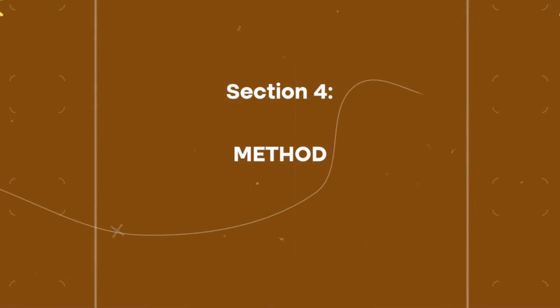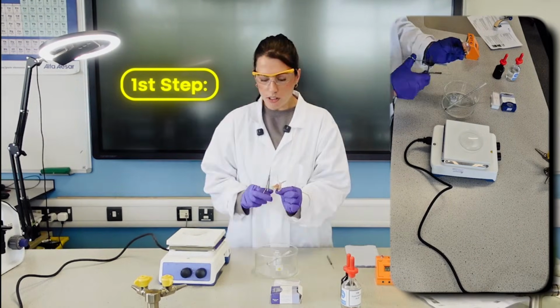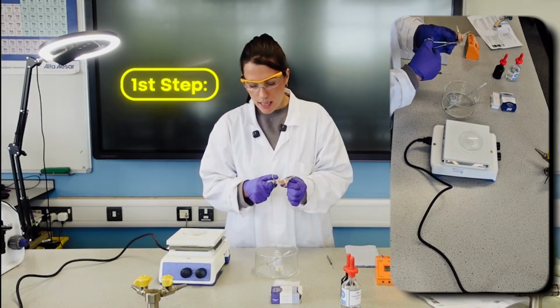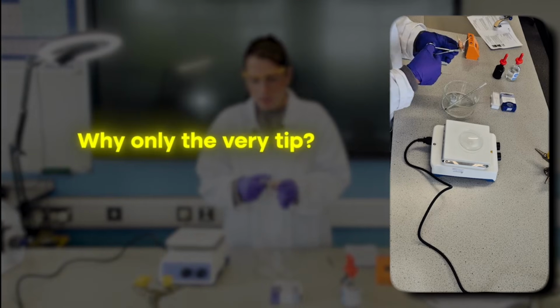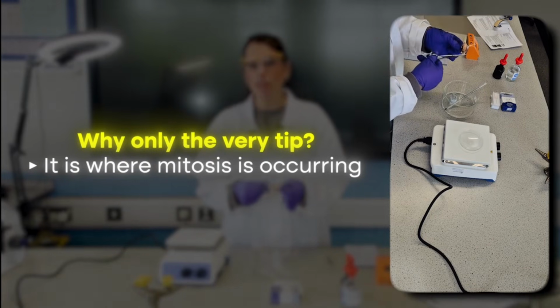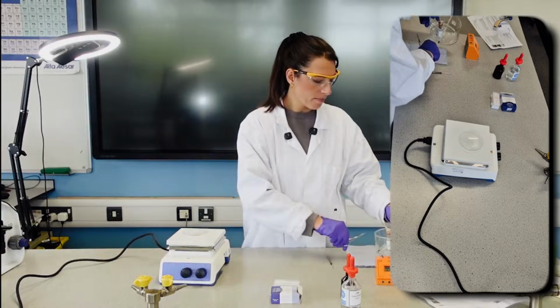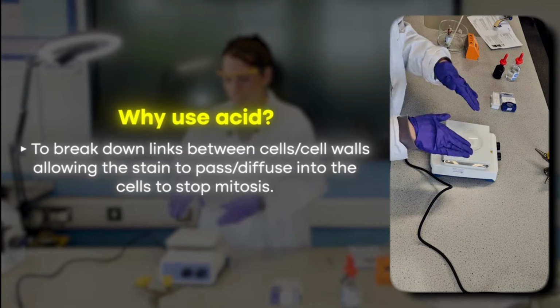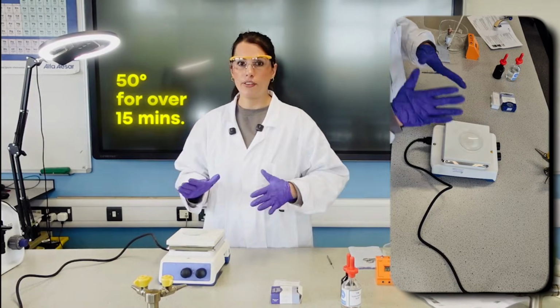So the first step I've actually already done and got set up because I was doing this earlier, but just to go through what you'd need to do. I've got the garlic, and using my sharp scissors, I cut off just the very, very tip of that root. It was about 3 millimeters from the end, and I took 3 root tips and I placed them onto this watch glass here with a few drops of acid, and it's been heating on this heating mantle at about 50 degrees for over 15 minutes.